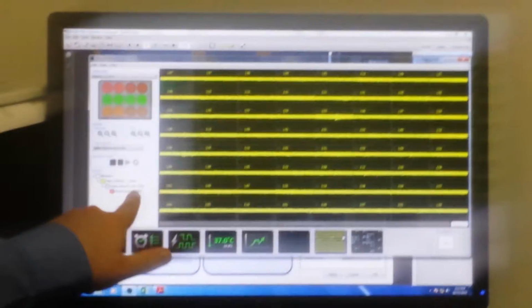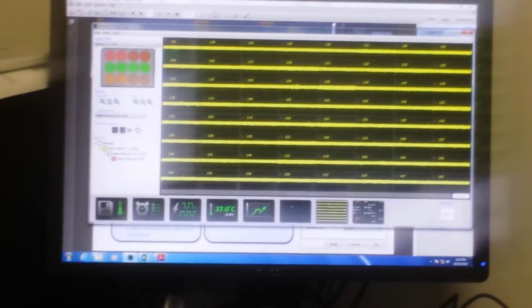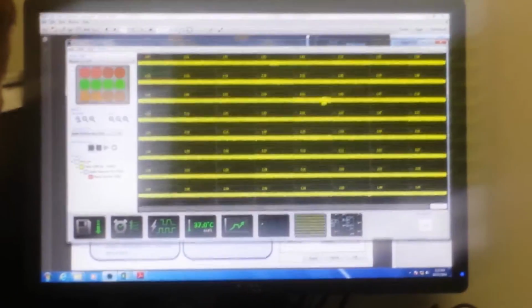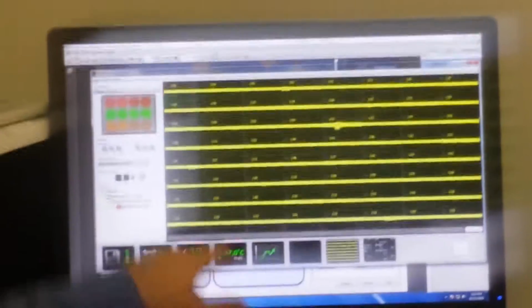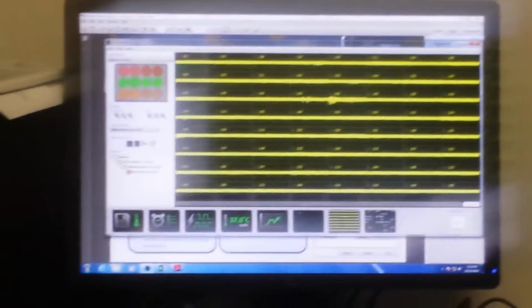Our recommended setting is 6 standard deviations. I'll zoom out. How did they not show these? Oh yeah, they're there. They're very faint, but there's little gray lines right here on each electrode. So the threshold's done on a per electrode basis. So if you have a noisy electrode, it has a bigger threshold. It's just so it's not picking up a lot of noise.